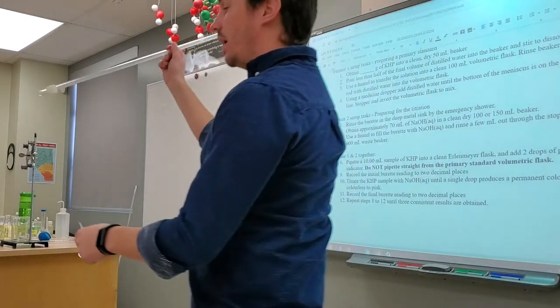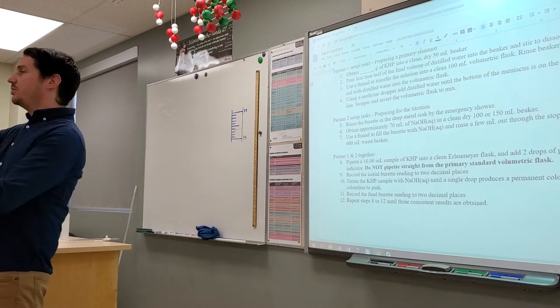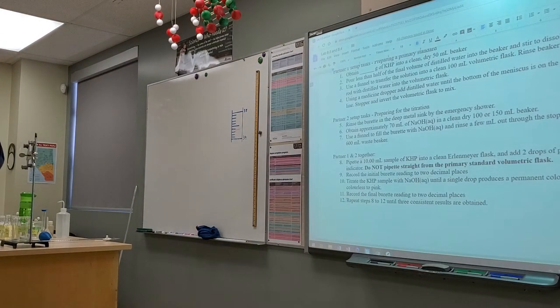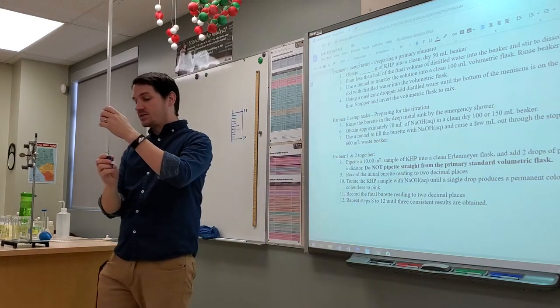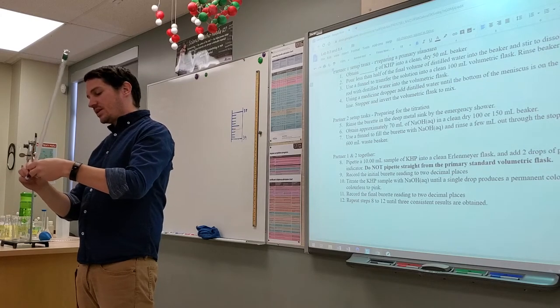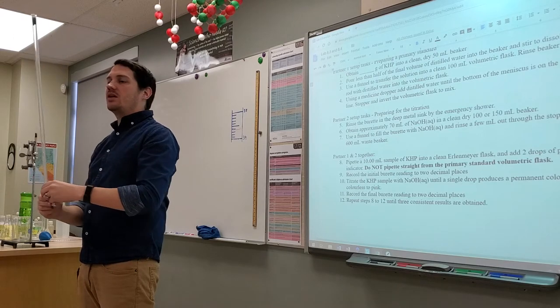You're going to grab one that has a plastic adapter on it. And the threads have to be pointing down, right? The numbers have to be right side up. And so you're going to put it on, and if it doesn't go on all the way, and if it doesn't fit snugly, you've got to either choose a different burette or choose a different stopcock. Is that okay? You just choose one, whatever. It doesn't have to take a long time, just make a decision. Thread it in, put it in place, and this is actually kind of a pain sometimes, but that's fine. There we go. Thread it in so that it's not going to come out.